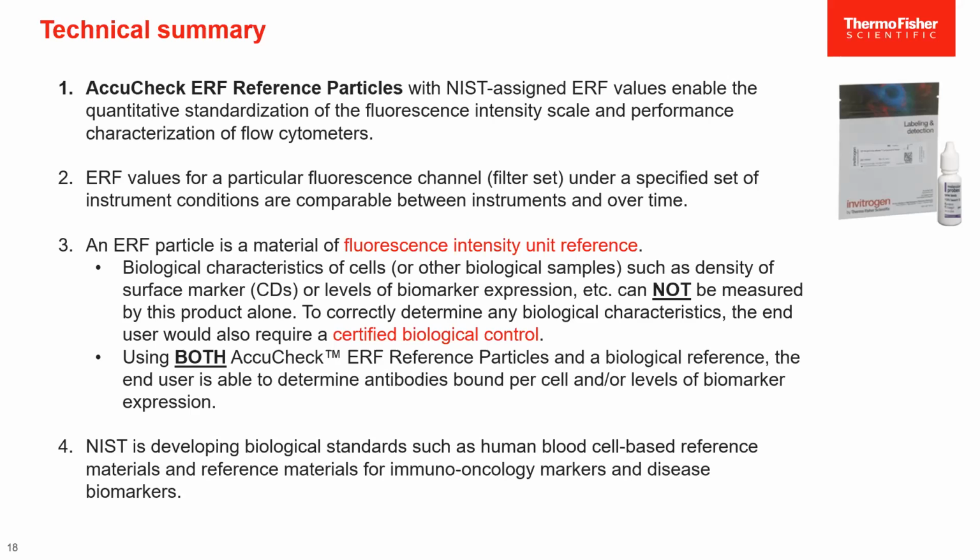The third thing you need to pay attention to is that this ERF particle is only a fluorescent intensity unit reference. The biological characteristics of cells, such as the density of surface markers or the level of biomarker expression, cannot be measured by this product alone.